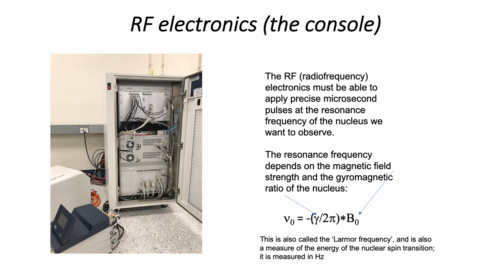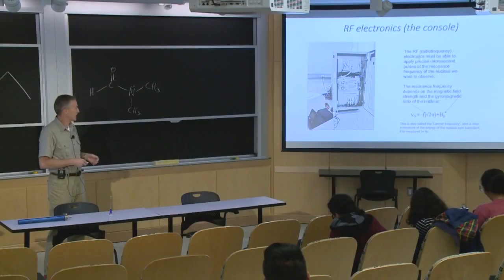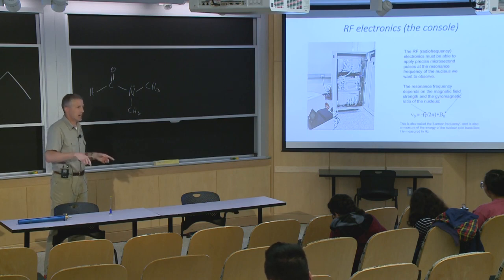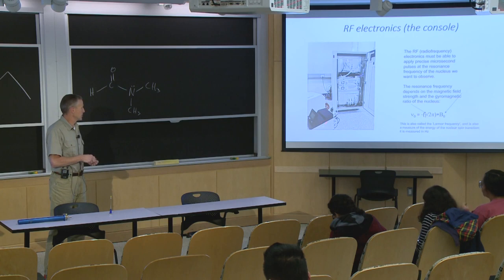You've got different boards. It used to be that these all were plugged into these long things with connections, and it talked through what was called a backplane, but now that these are modern digital consoles, it all talks via Ethernet. So everything has an address and it talks to each other. It routes the signal to where it needs to go. You've also got some preamplifiers here.